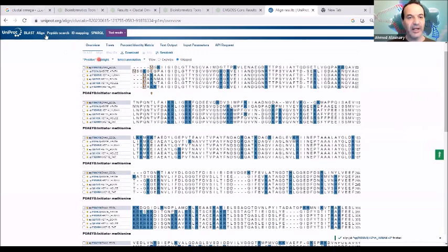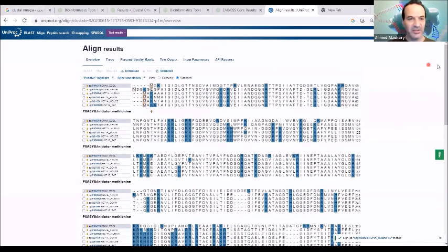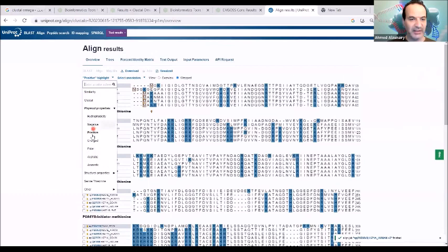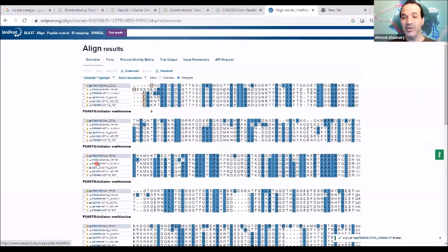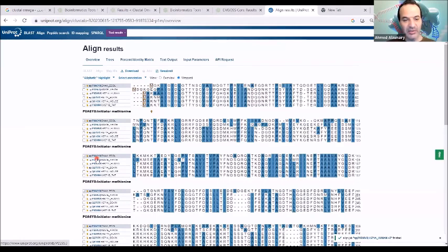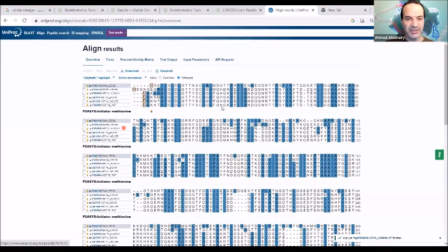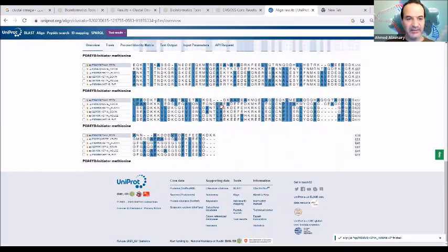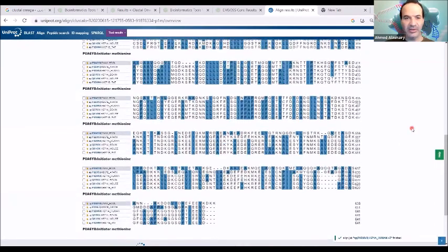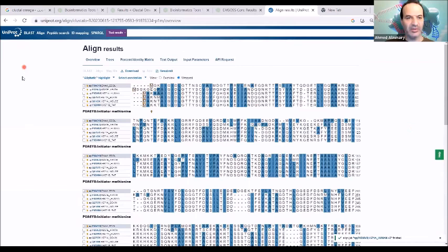You can highlight other things as well — not just positive and negative, but also the polar regions, aliphatic regions, and aromatic regions. Depending on what you want to do, multiple sequence alignment is a tool used in bioinformatics to extract a lot of information that can be used later in your research. All this information can be extracted and visualized on the result.